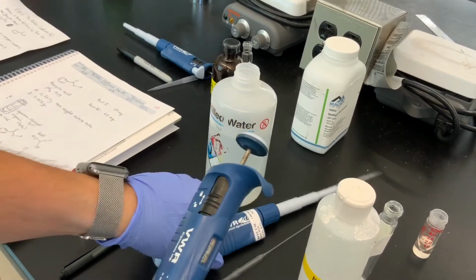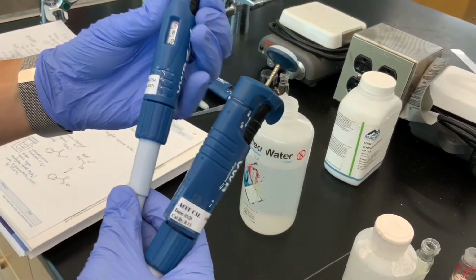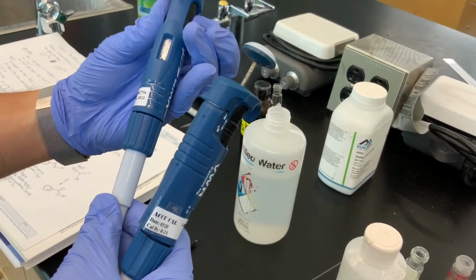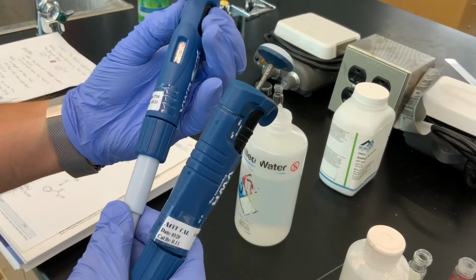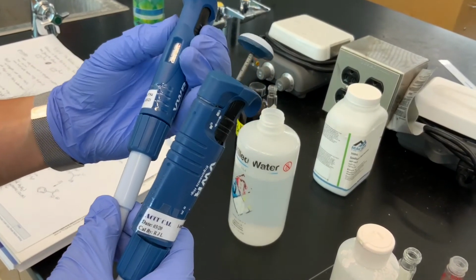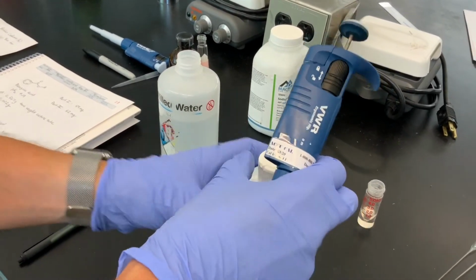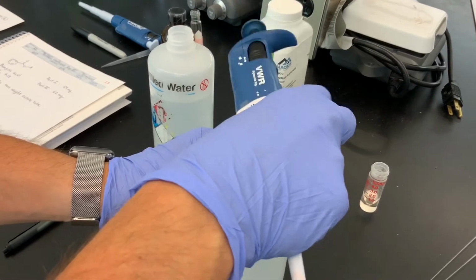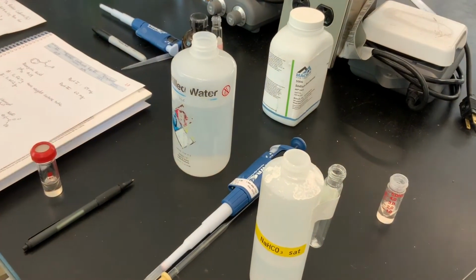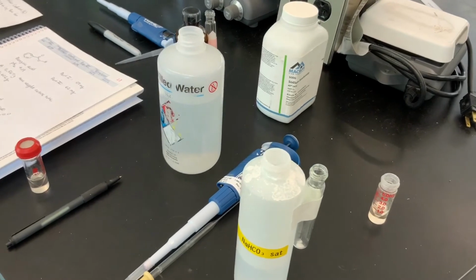Lock it in place. We did that for this one too, right? No, we didn't. We actually added more water than we should have. Whoops. That's why you always check. But that means this is a source of error for part A. So we'll start it over, but you don't have to watch. We'll do it really quickly. All right, so part B.